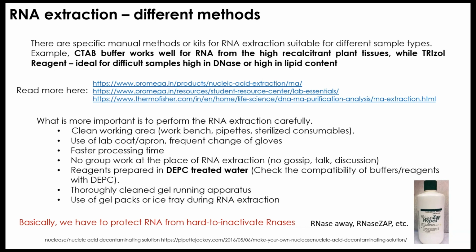So you have to be very fast when you are doing the RNA extraction procedure. You cannot keep the tissues or cells without a buffer for a longer time, because then the degradation of the RNA happens before you do the lysis, right? There should not be any group discussion, gossip talk, or any sort of collaborative work when you're doing the RNA extraction at a particular place. You have to work very quietly, very calmly, with full attention.